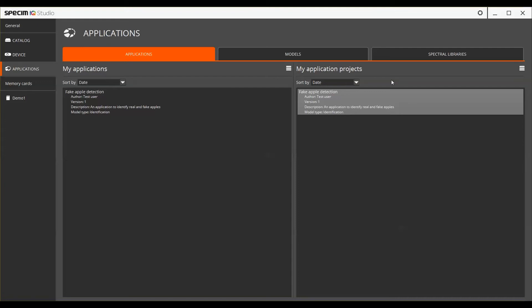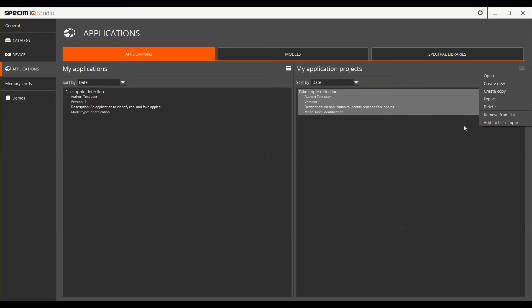To create a new project, select it from the burger menu. To open up an existing project, you can either use the burger menu or double-click on the project.